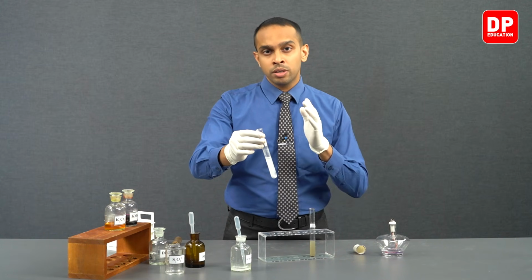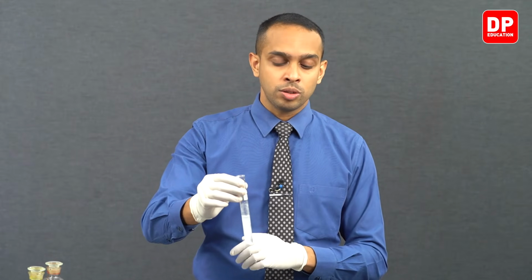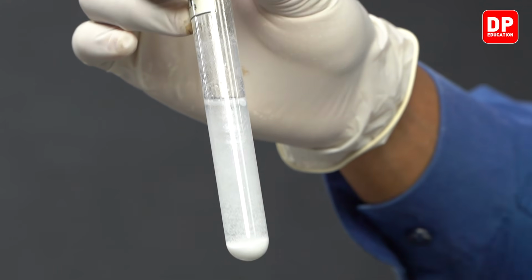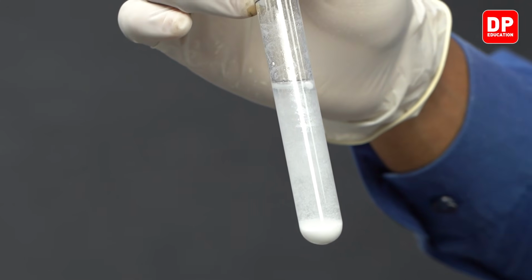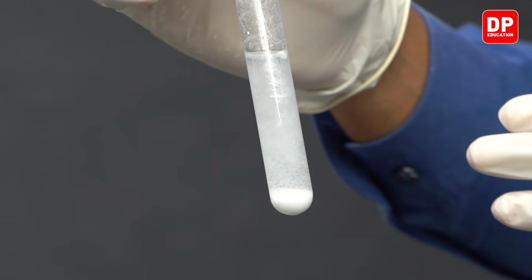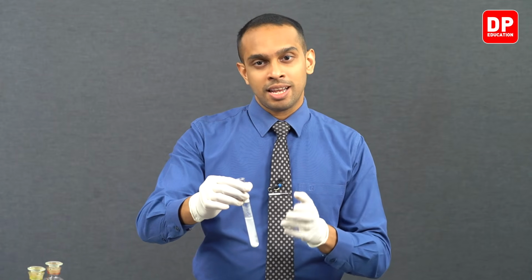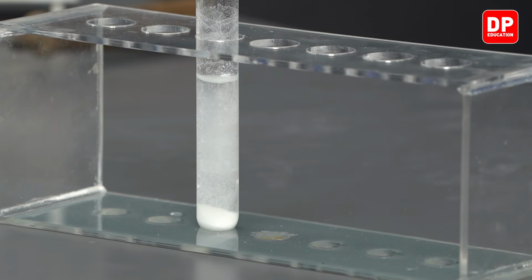So the precipitate that you observe here, which is sinking to the bottom, is lead thiosulfate. If you heat this reaction mixture, you will observe that this white color lead thiosulfate will turn into a black color precipitate, which is lead sulfide. Let's observe that reaction.